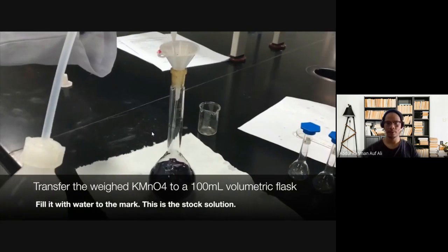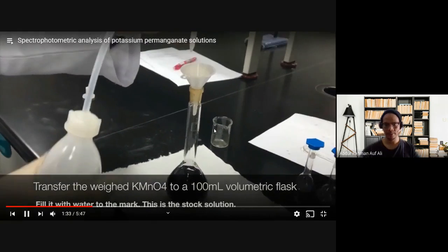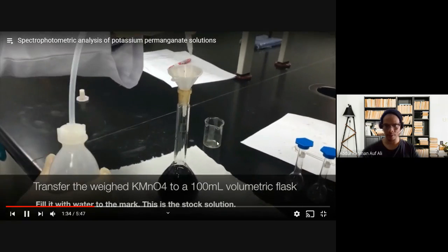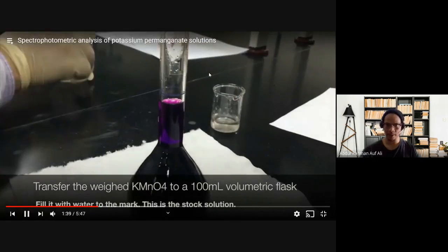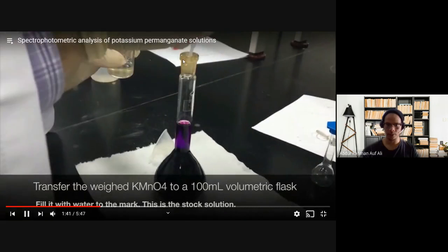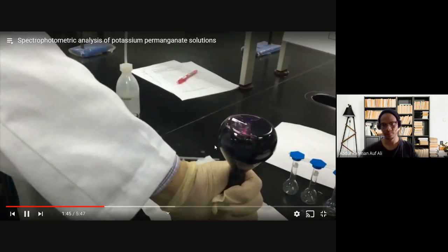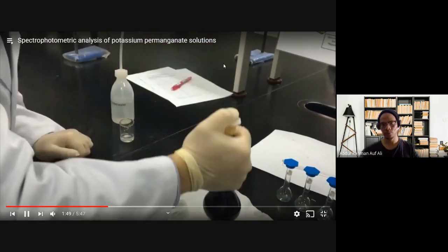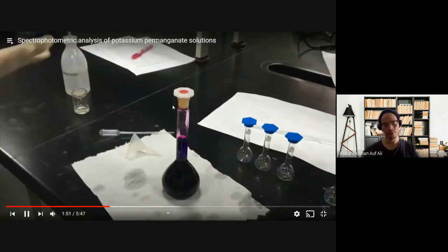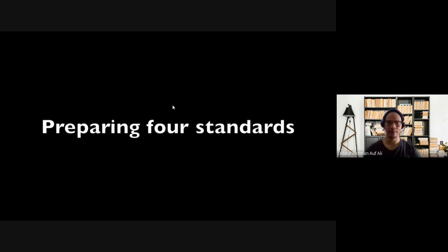If there is purple residue here, that means a little of the 126 mg we weighed did not go into this. So we want to put everything in. That's why he keeps washing this beaker until there is a clear solution. So after everything is inside the volumetric flask, close it with the stopper, and then shake it like he did earlier. Invert it. Now we have a well mixed standard solution.